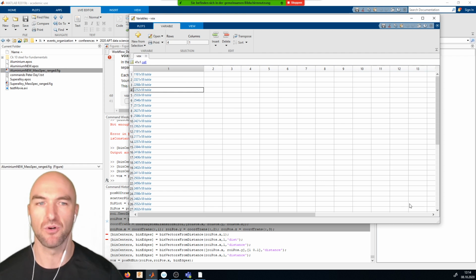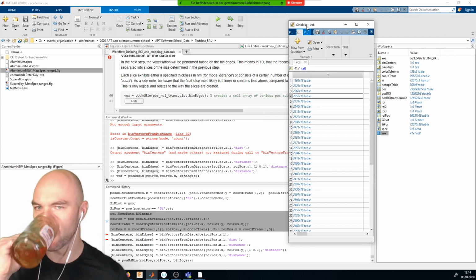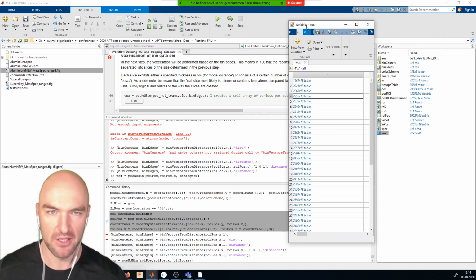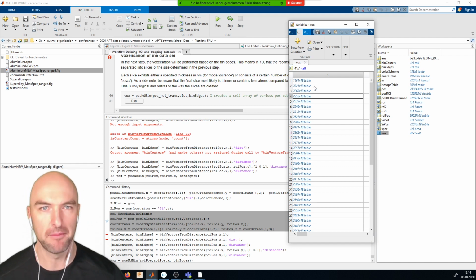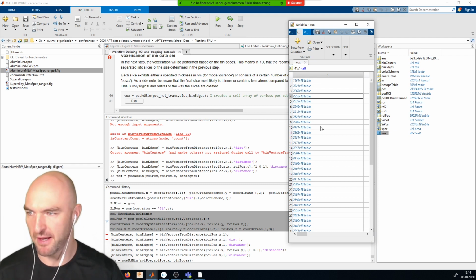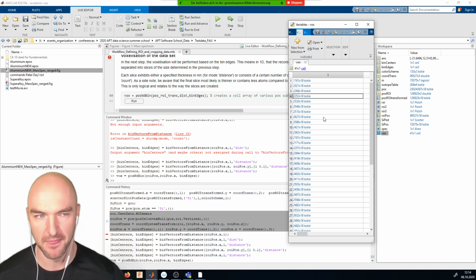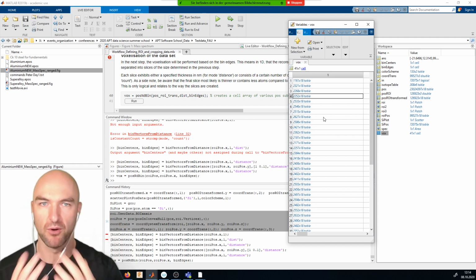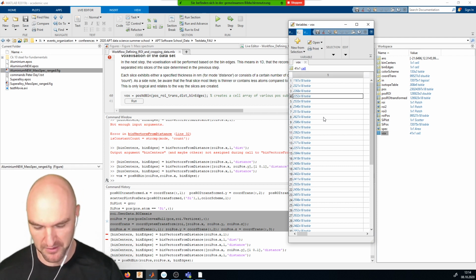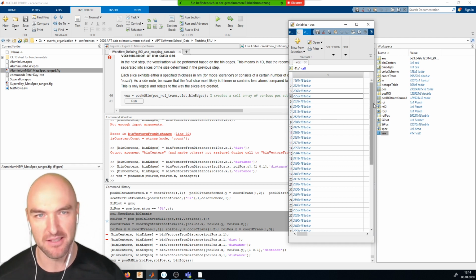And that's what I was talking about when I was talking about using something like deconvolution to calculate concentrations. So what you can do is apply a concentration function on each of those sub-POS variables and calculate the concentration there. And this means you're no longer dependent on saying, okay, this atom is this atom is that, but you can essentially work on the mass spectrum of each of those sub-variables. Again, we haven't implemented much of that yet because I was hoping for people like Andy to help us out a little bit here. But this is essentially what we do with the binning.